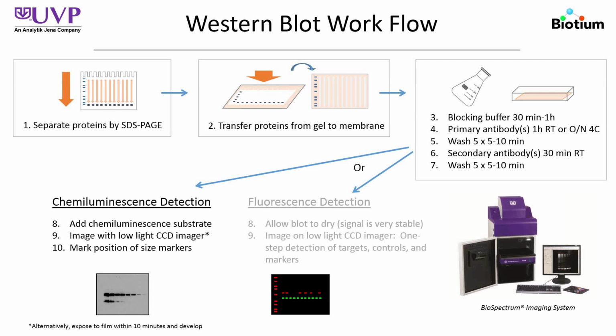Now, you can also expose this blot to film, and as I'll cover a little bit later, I'll explain why film is really a very insensitive technique that has a limited dynamic range.